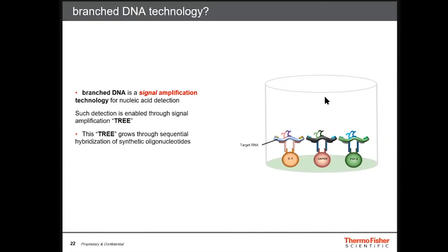As you can see here, again, this is an underestimation of what's going on. A bead's about 8 microns, so it's about as big as a cell. This is supposed to represent an RNA molecule. And again, we're typically covering about 500 bases. And the specificity of capture is dictated by the tails of each of these capture probes.